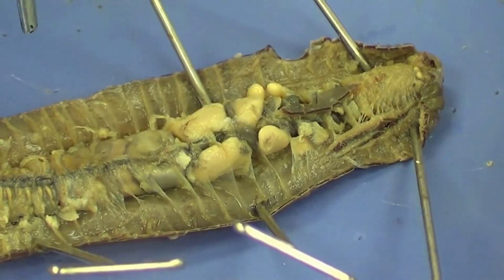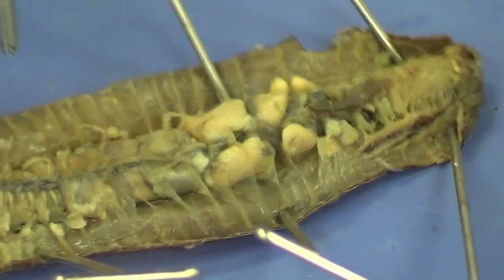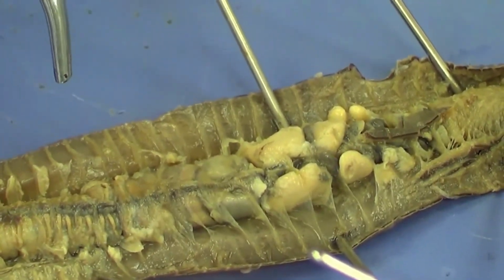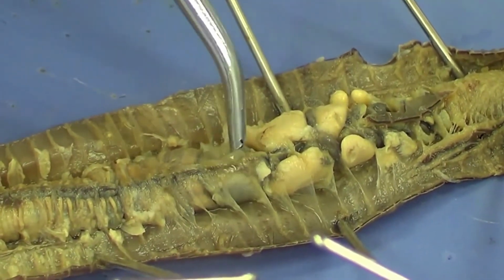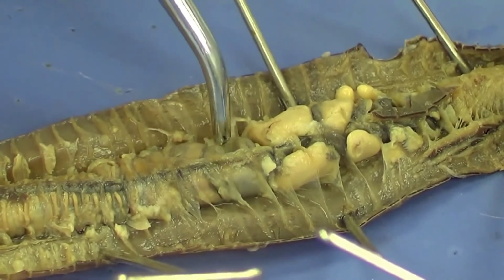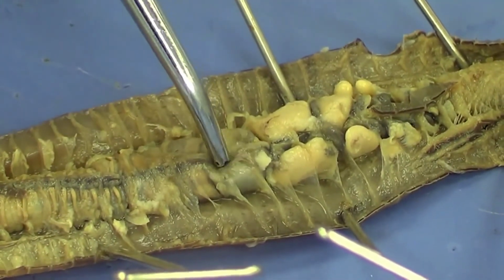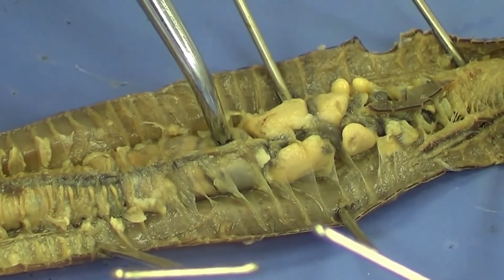Part of dissecting is not just naming the parts, but being familiar with what the parts look like, what they feel like. And this should be very soft, very distensible, so that it can enlarge easily. If this was thick material, it would not be able to enlarge. That's going to be the crop.